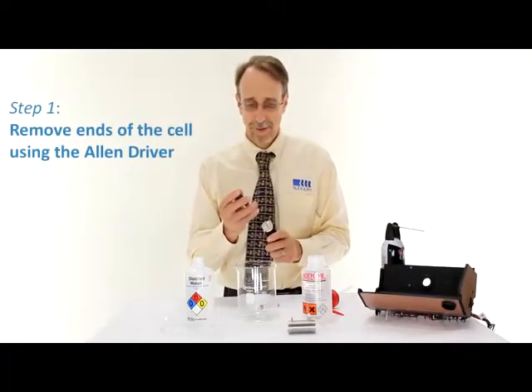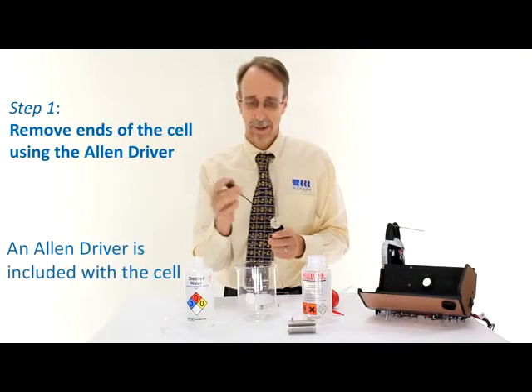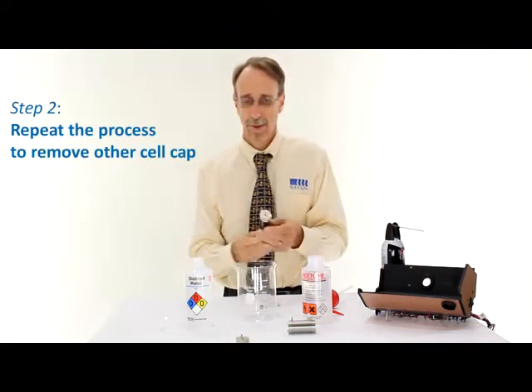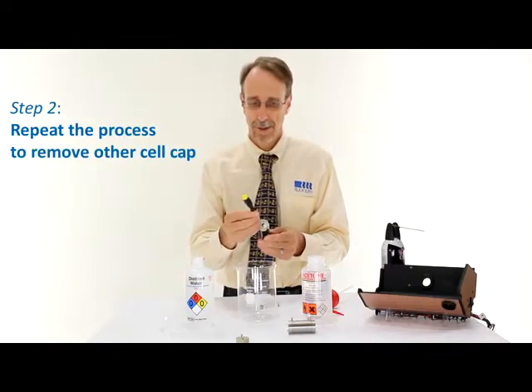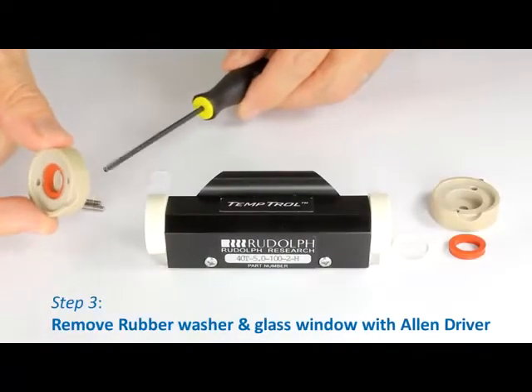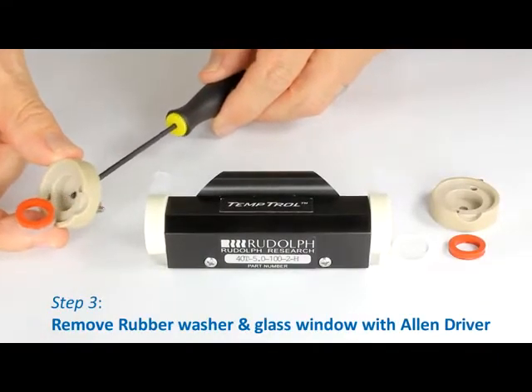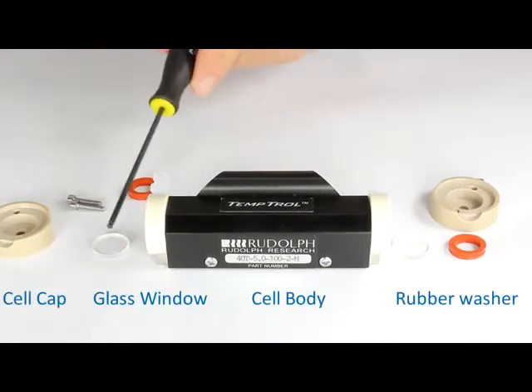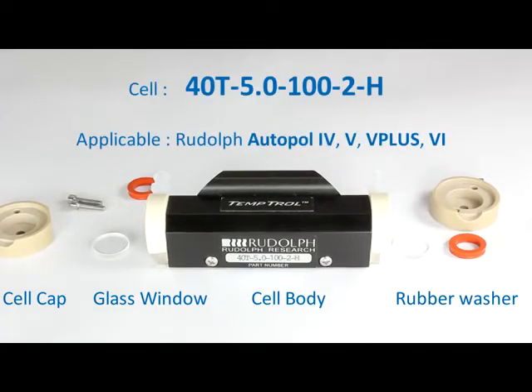Start by removing the ends of the cell using the Allen driver. The end of the cell will come up, and we can also remove the other end using an identical procedure. We now have three wetted parts: both ends and the center of the cell. These can be washed in a laboratory washer or an ultrasonic bath, and dried either by leaving them on the sink or in a laboratory drying device.